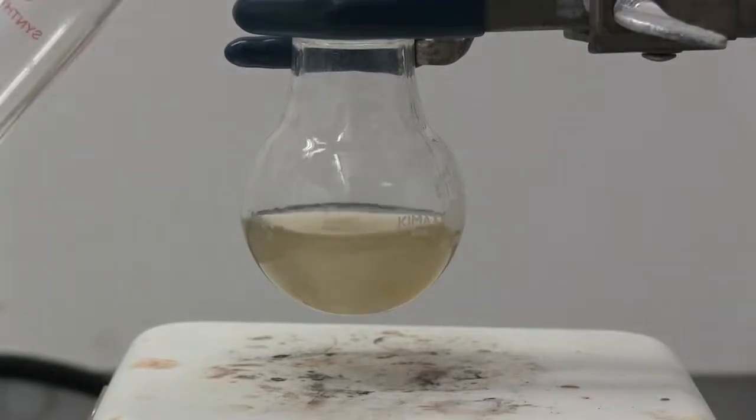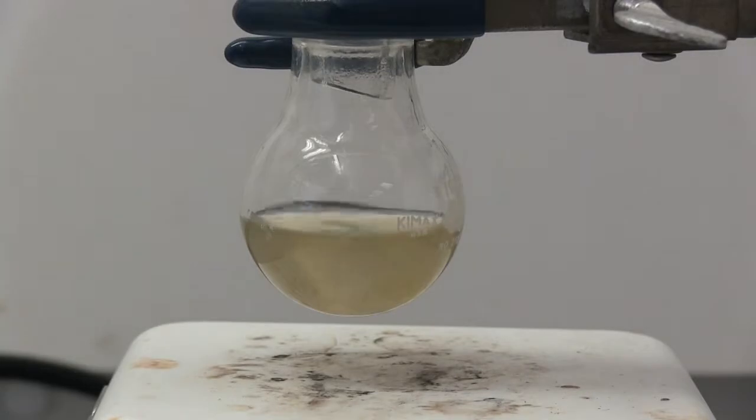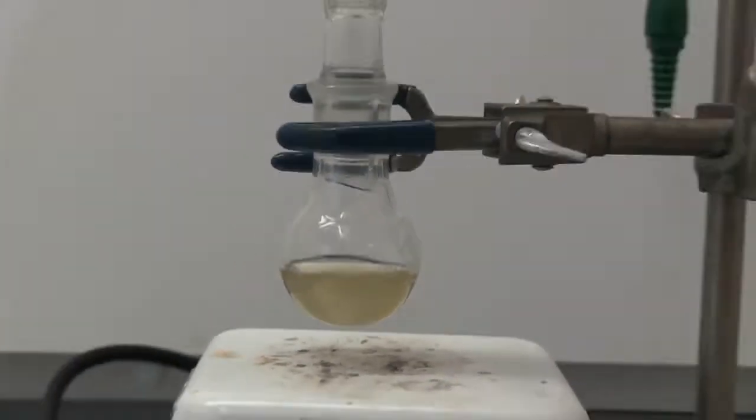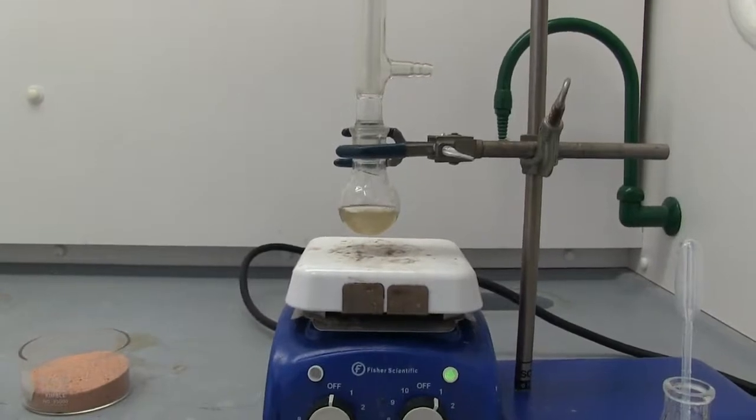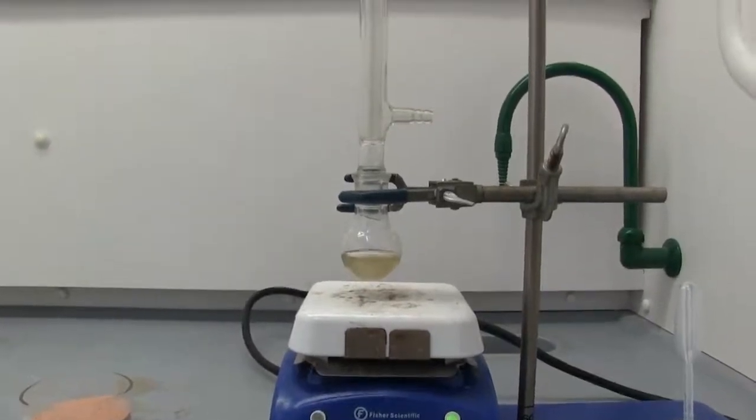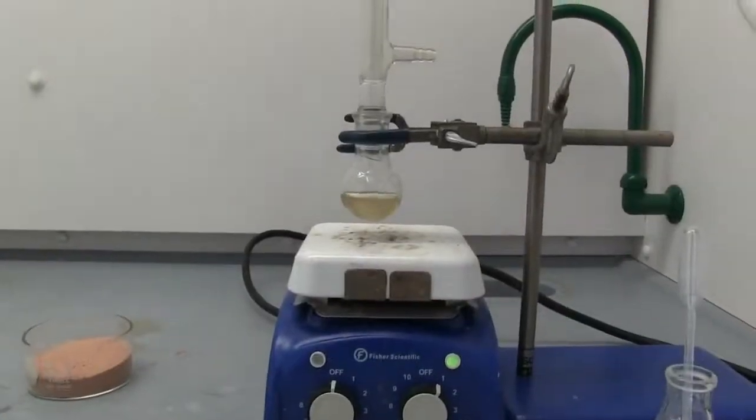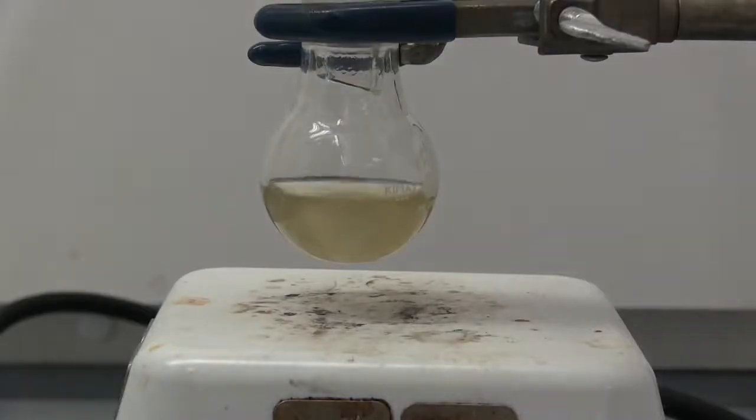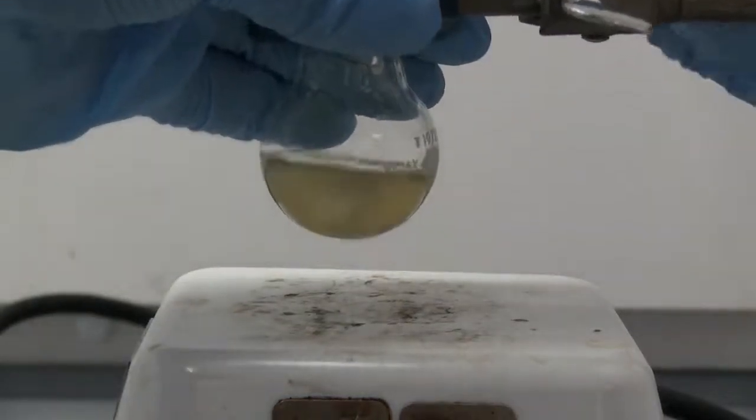Now you'll get our condenser on there. You don't need to attach it to water. You can just put it on and then put the drying tube at the top. Let me zoom out and show you what set up we have. So we have the flask on the bottom, condenser, and drying tube. Like I said, you don't need to set it up to water. So now we're going to put a sand bath underneath it so that we can heat it up.